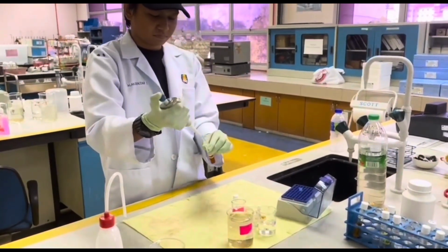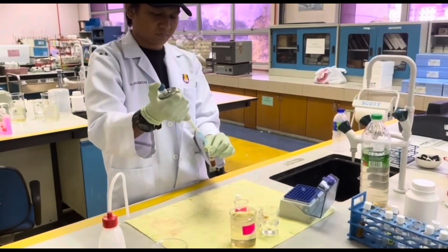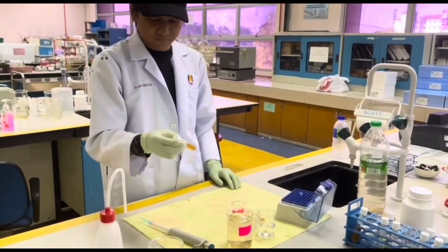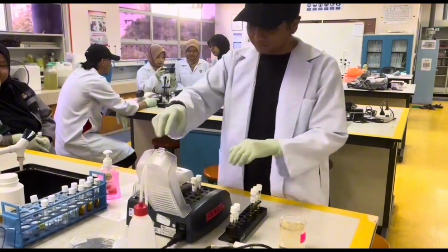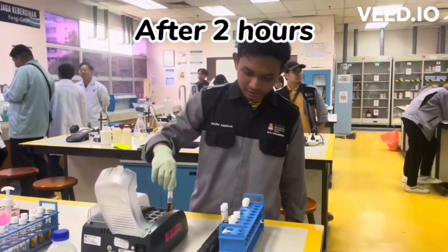After we have prepared the vial and the blank sample, we need to preheat the COD reactor to 150 degrees for 50 minutes. After we preheat it, we need to put all the vials and the blank sample into the COD reactor and wait for 2 hours. Remove and cool to room temperature.